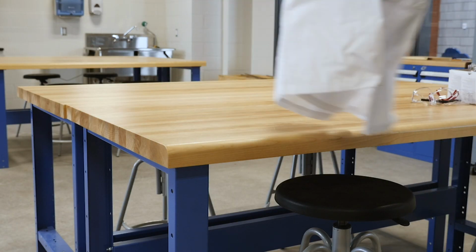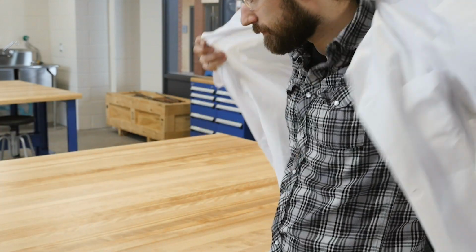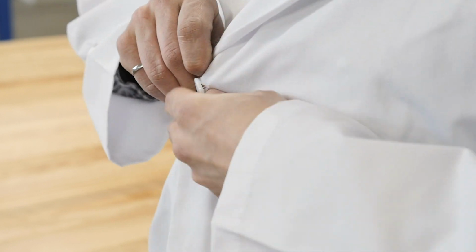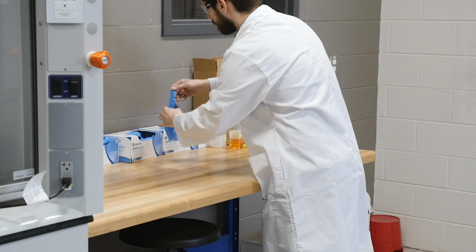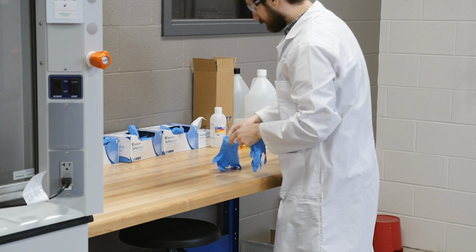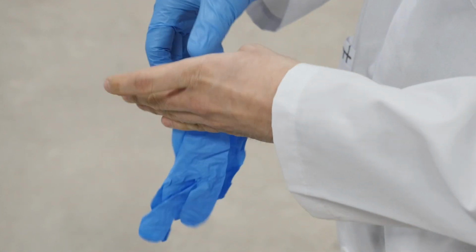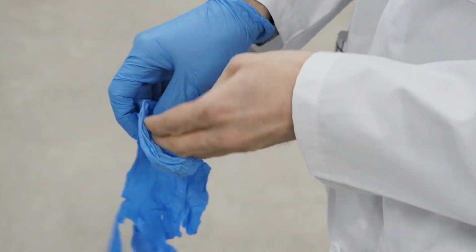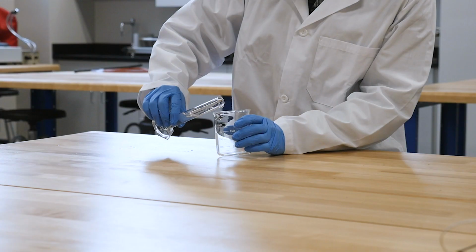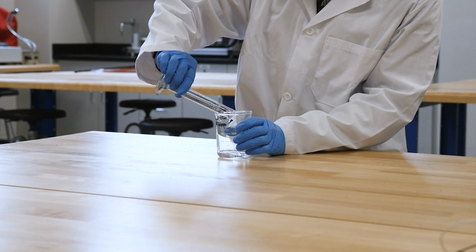When working with hazardous chemicals, it is also important to protect the rest of your body. Clothing should be worn which covers all of your skin, such as a lab coat, long sleeves, and full-length pant legs or tights. You must also wear gloves to protect your hands when working with hazardous chemicals, most commonly disposable nitrile or vinyl gloves. If you have been working with chemicals or biohazardous materials, do not continue wearing PPE after leaving the laboratory, as there is a risk that it has been contaminated.